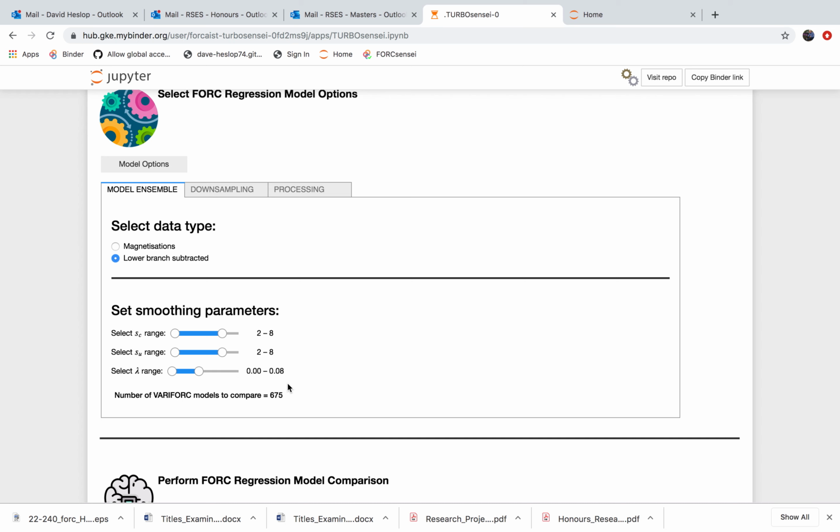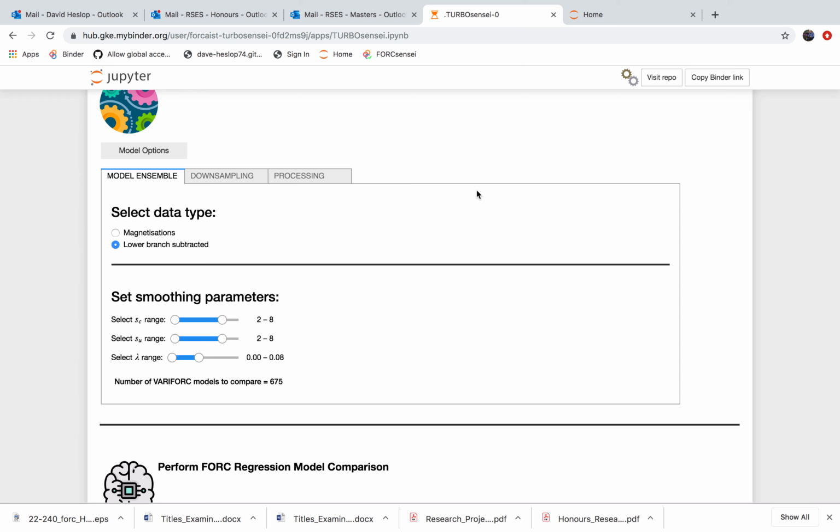Now, another thing that's worth emphasizing is that although this takes about 10 minutes on a free cloud service where we only get allocated 2 CPUs and 1 GB of memory, if we put it onto a private cloud service, then obviously we can speed up the calculation as required by simply paying for more CPU time, paying for more memory, and so on. So we have to make a decision of, is 10 minutes long enough, or are people willing to wait 10 minutes to process, or do we need to offer this in higher speed processing?